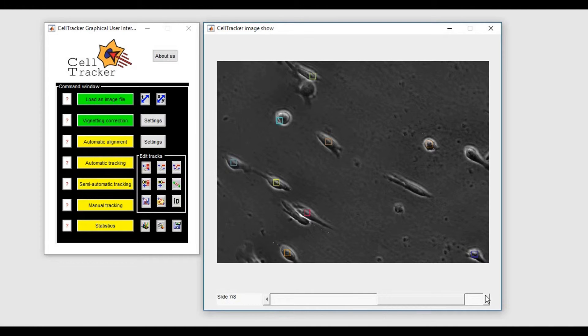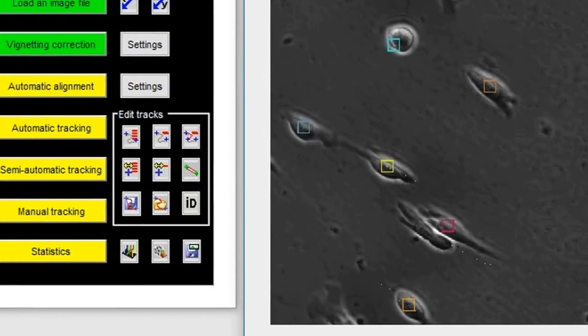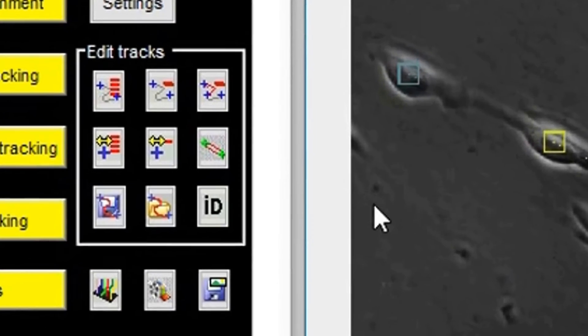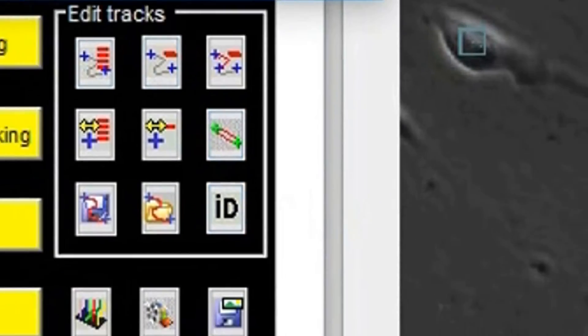You can check and change the identification number of a track at every time point using the Change Track ID button.